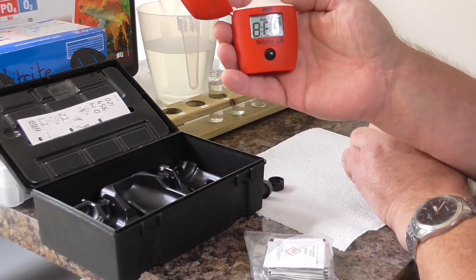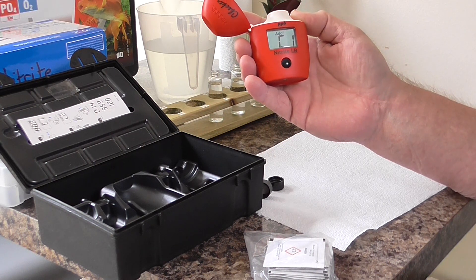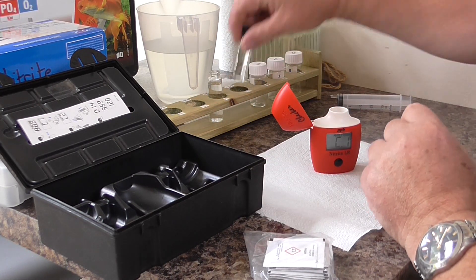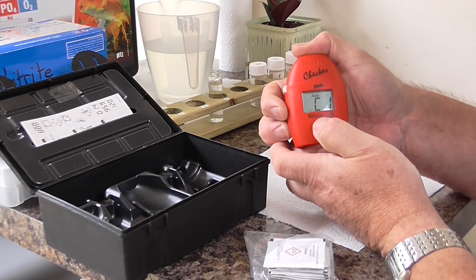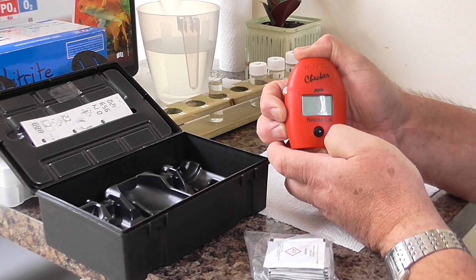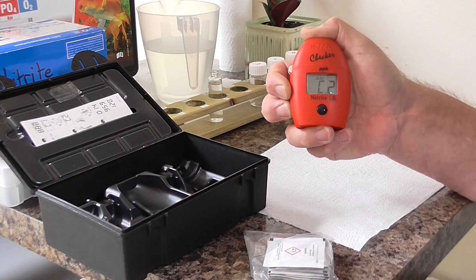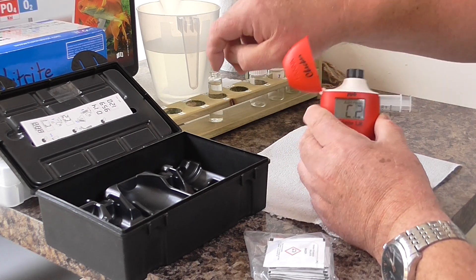Switch the meter on. You'll see C1 displayed, which means it's ready for water. Put the ordinary pond water in, press it again, and it'll come up with C2, which means it's now ready for the water with the reagent added.